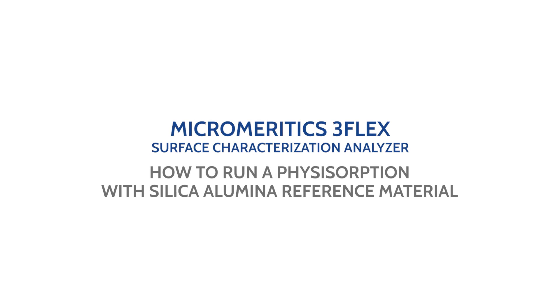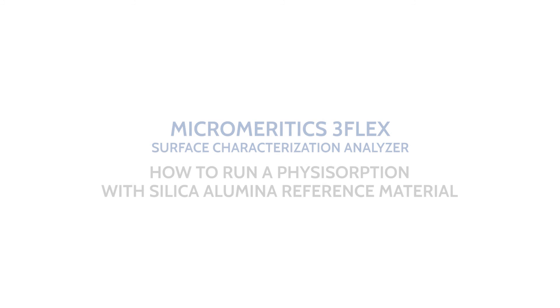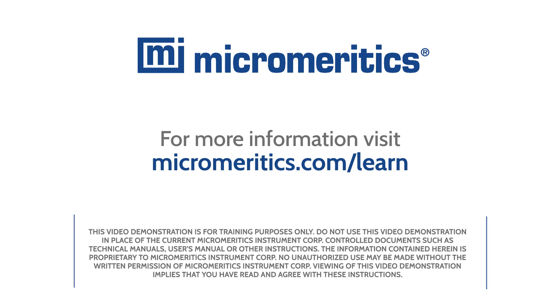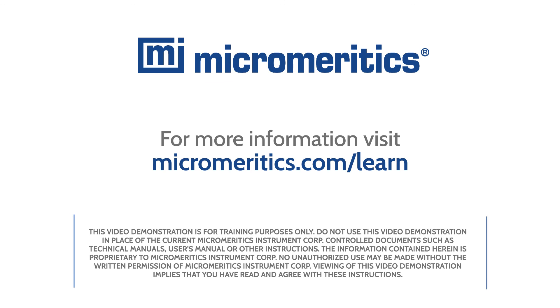Now you are ready to run a nitrogen isotherm with the silica alumina reference material on the Micromeritics 3-Flex surface characterization analyzer. For more information, visit micromeritics.com/learn.